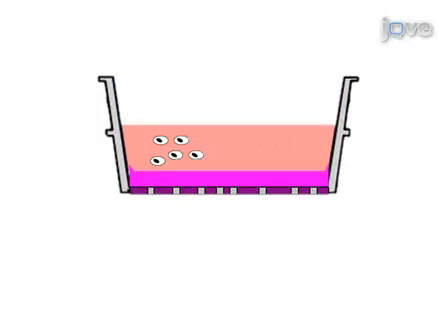The tumor invasion assay begins when cells are added to fluoroblock inserts coated with matrigel, a reconstituted basement membrane.